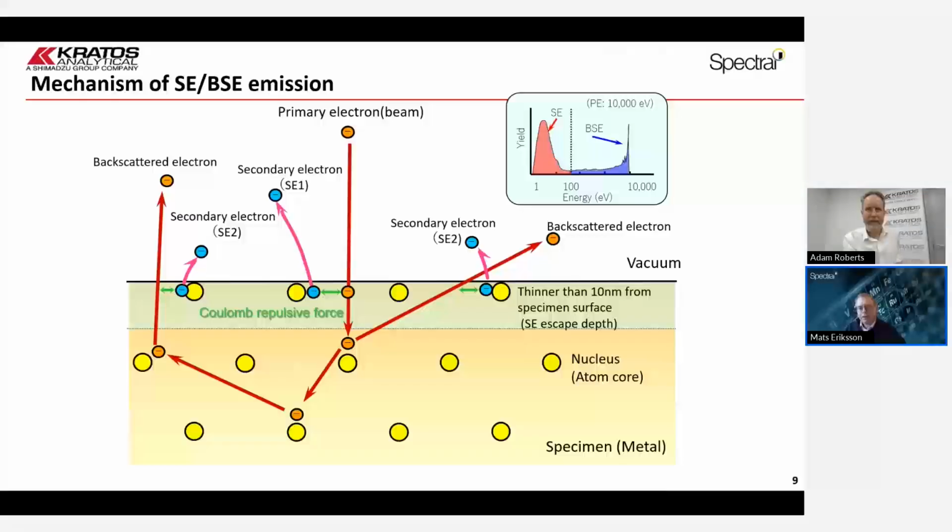Yeah, I think it is important to go back to those fundamentals, right? When we talk about XPS or surface analysis, what do we mean by surface? How close are we to the actual atomic surface? And SEM, in the XPS community, is seen as very much a bulk technique, and in the SEM community, it depends on the settings and the detection principles that you use.